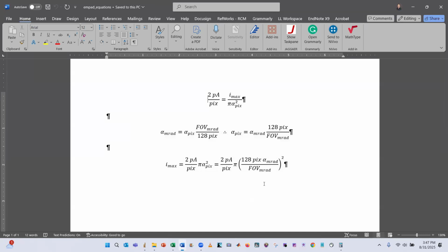Okay, again, this is assuming that all of the current is inside of your direct disk. Obviously, if you're in vacuum, that's going to be the case, but that's not going to be the case if you're doing an actual diffraction experiment, okay? Especially if you have strong diffraction conditions, but, so they say, better safe than sorry. So anyways, we can calculate this very easily, okay?